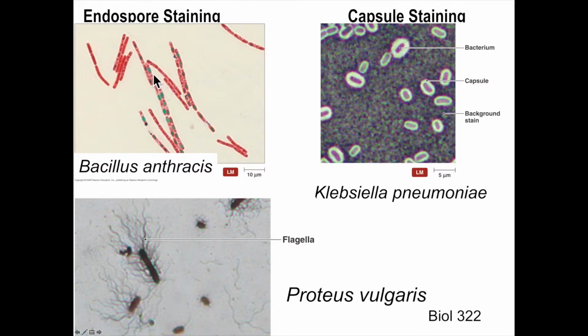So we've already talked about endospores in another section, and so you can see that. Before the bacteria completely degrades and releases its spore, as we talked about in another section, they're inside the cell still, and that's why they're called endospores. And so this is a differential stain where spores are stained green. And so if you look at that and you say, oh, look, there's a red cell and there's green spores inside of it, you know that that bacterium can produce spores, and so that allows you to differentiate different types of bacteria.